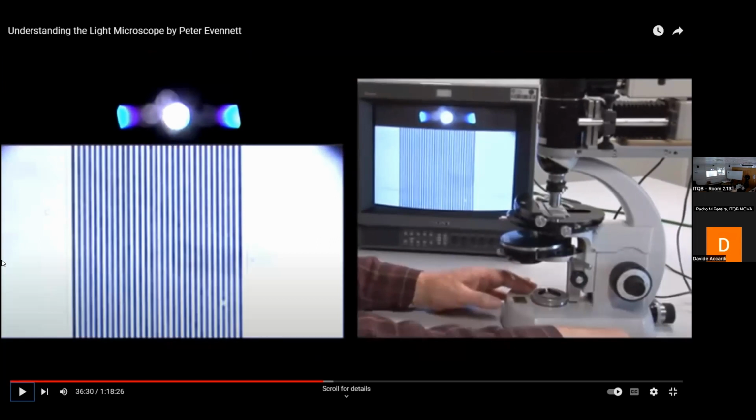So the diffraction pattern is a function of the size of the object: the smaller the object, the larger the diffraction pattern. And it is proportional to the wavelength: the smaller the wavelength, the smaller the diffraction pattern. That's why, to squeeze the information in, you either have a large numerical aperture for a tiny object that has a giant diffraction pattern, or you have a very short wavelength, so the light bends less and can fit inside the opening of your objective. And now he will explain this in the last minute, basically.